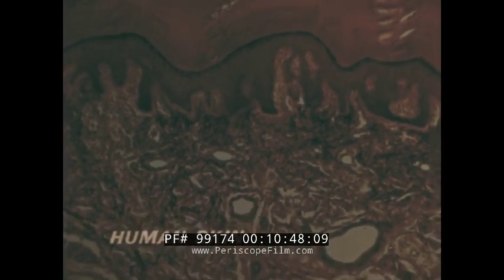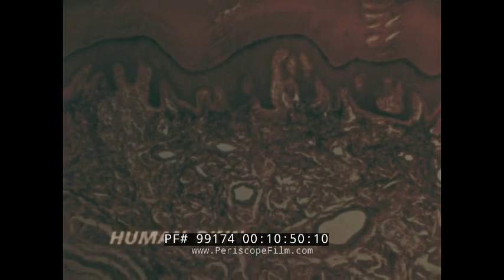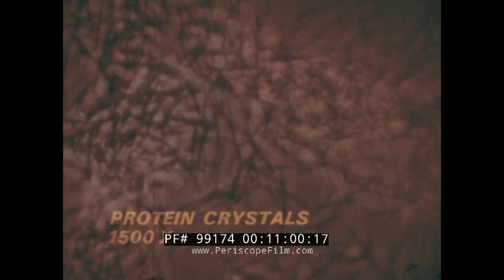In the range where the light microscope produces useful resolution, the information content of the images is very good. Generally, the size, shape, and many architectural and chemical relationships can be determined. And of course, many living objects can be studied too. But the light microscope has a useful magnification of at most 1,500 times.